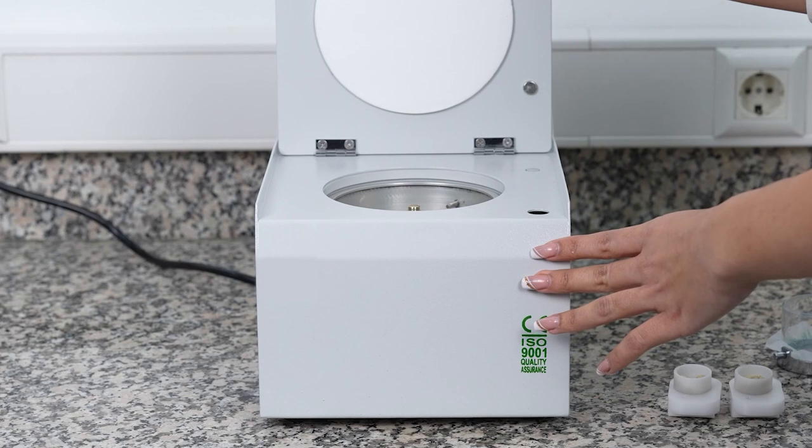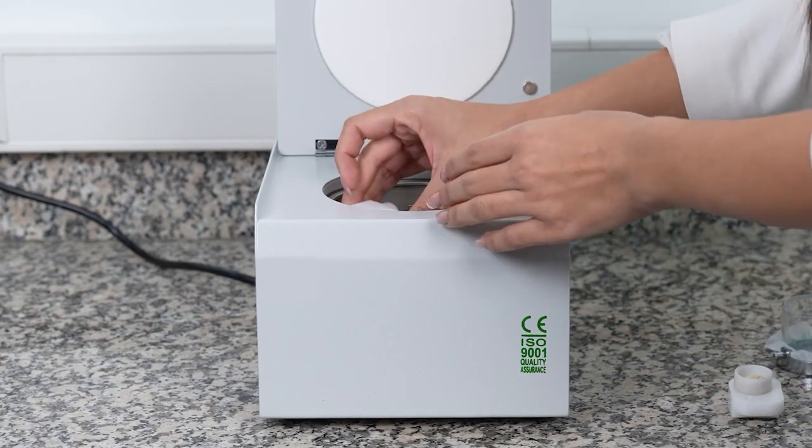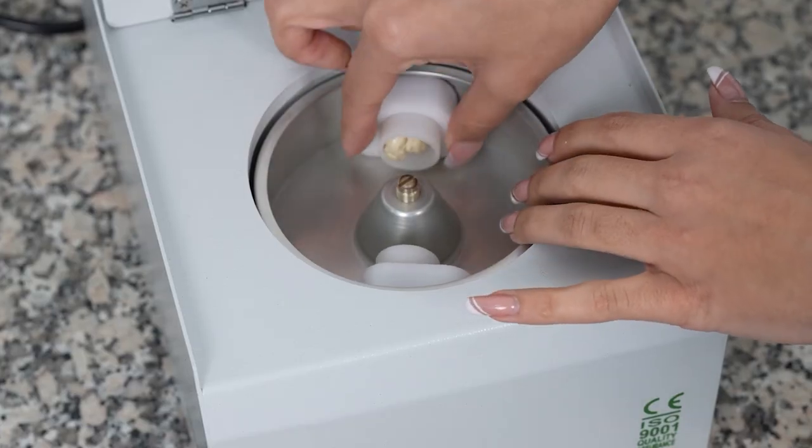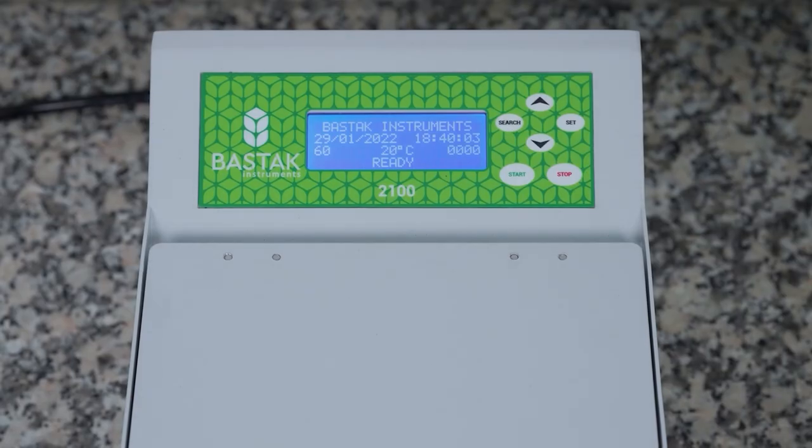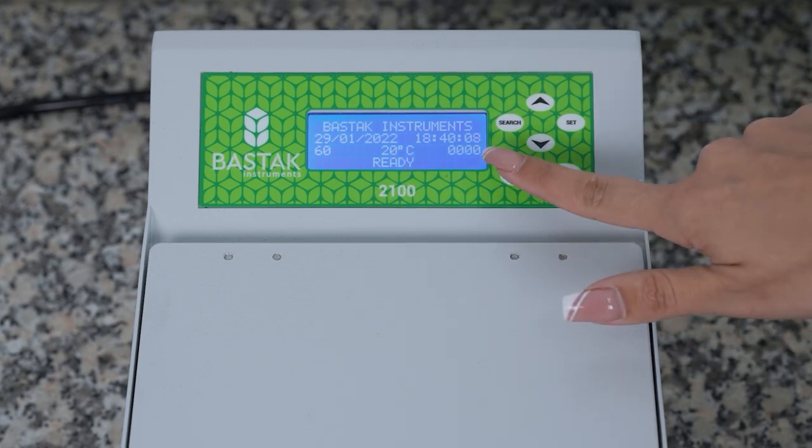The cover of the gluten index device opens. Afterwards, the cartridges with wet gluten samples are placed on the cartridge pins in the index device and the cover is closed. After the ready text is seen on the LCD screen, the device is started by pressing the start button.